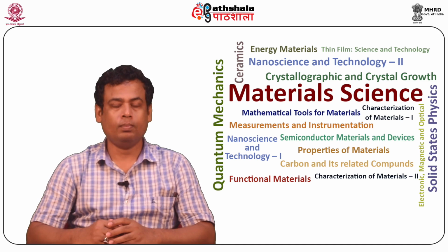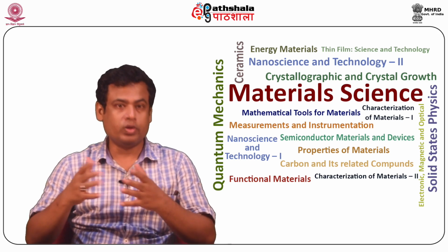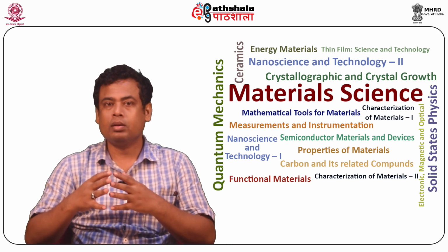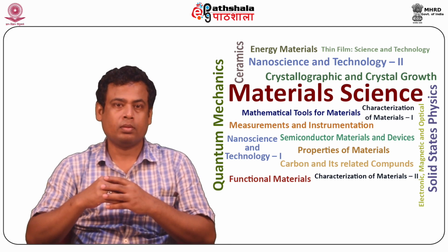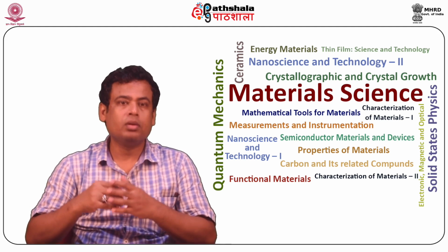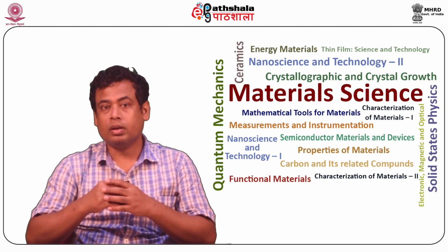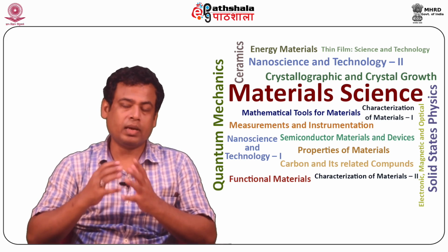So students, let us summarize what we have learned in this module. We learned about the typical Auger electron spectroscopic methods, where the spectrum is a plot of intensity versus kinetic energy, and it is also a plot of the first derivative of intensity versus kinetic energy.